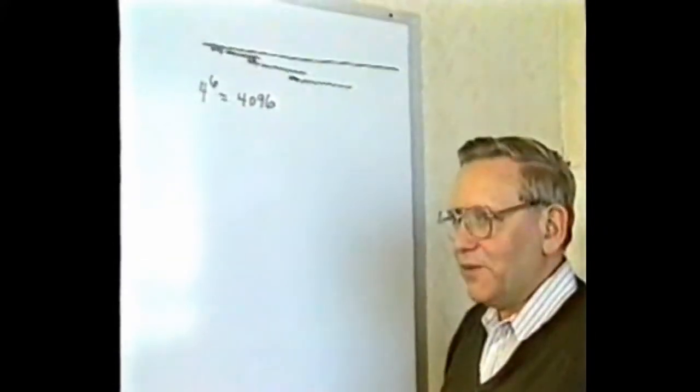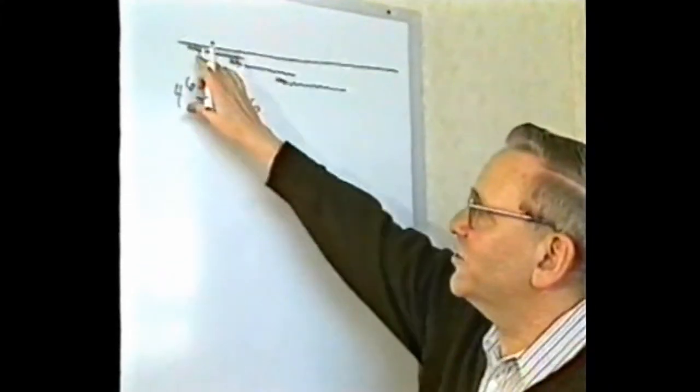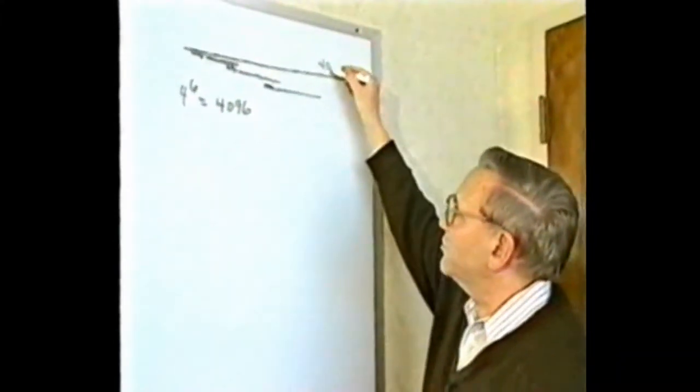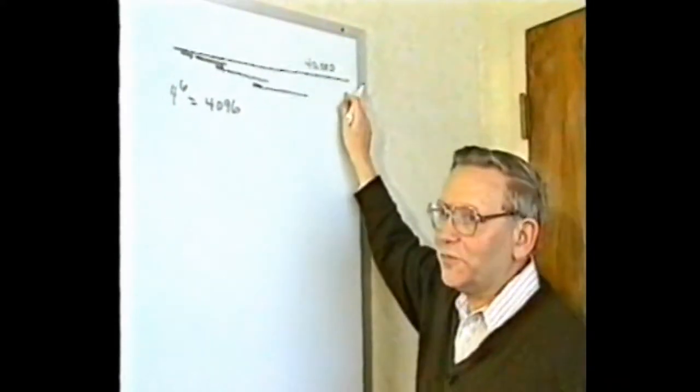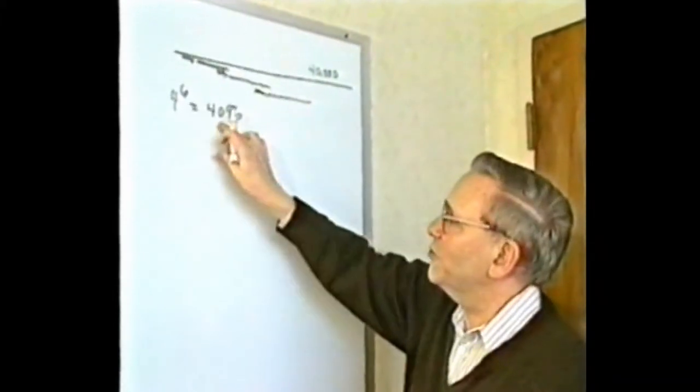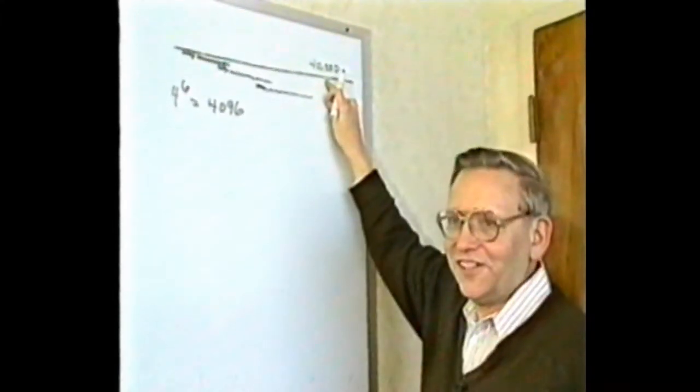These primers appear repeatedly in the human genome, so they can be used over and over. This greatly reduces the cost of primers, and since the primers are readily available, it also increases the speed of sequencing. Problem is that a hexamer isn't long enough. If your template is 40,000 bases, say the size of a cosmid DNA, the same hexamer would occur, say, 10 times in there.